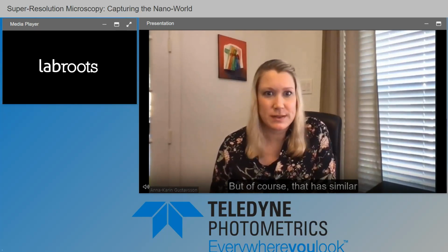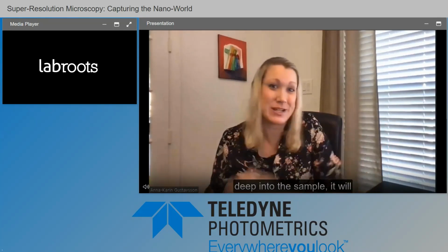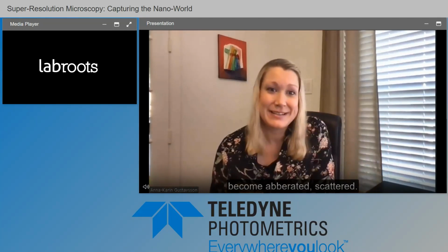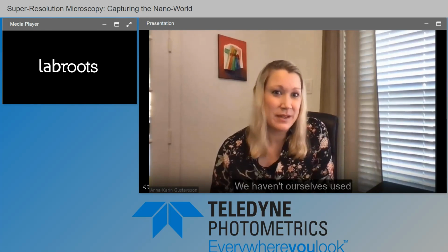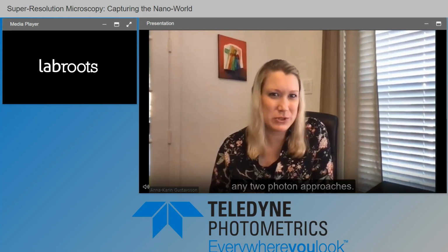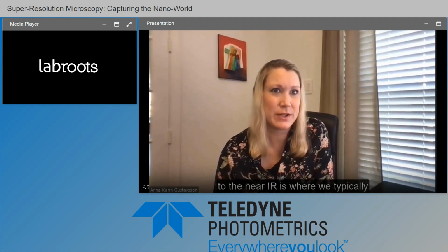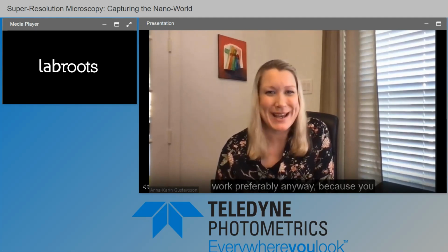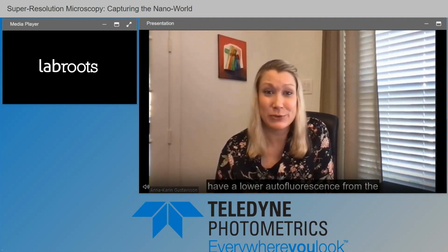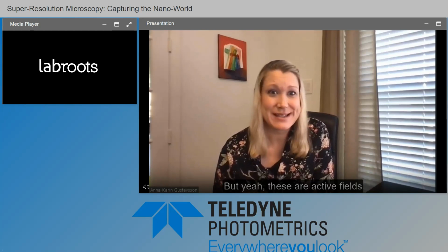But of course, that has similar issues when you're imaging larger structures, right? If you want to penetrate deep into the sample, it will become aberrated and scattered. We haven't ourselves used any two-photon approaches. That is one way. And of course, going to the near IR is where we typically work, preferably anyway, because you have lower autofluorescence from the sample in that regime, which improves the single molecule imaging too. But yeah, these are active fields of research to improve those types of situations.